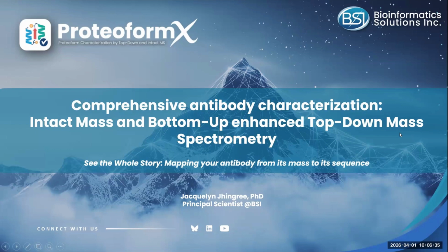Today I will be speaking to you on comprehensive antibody characterization using intact mass and bottom-up enhanced top-down mass spectrometry. Pretty much I will present on this combined approach that our lab uses to enhance our antibody characterization. I will take you through a series of different antibody characterizations of varying complexity.